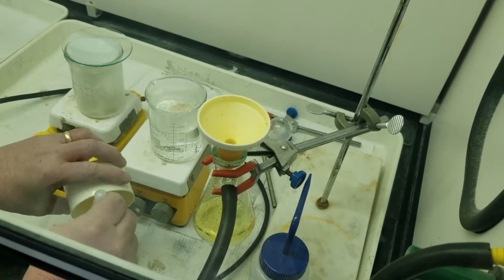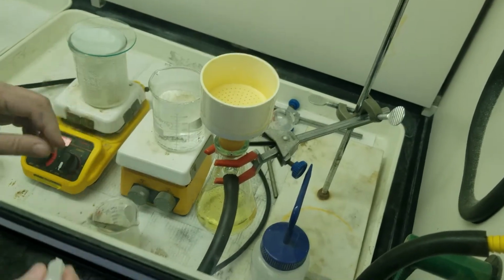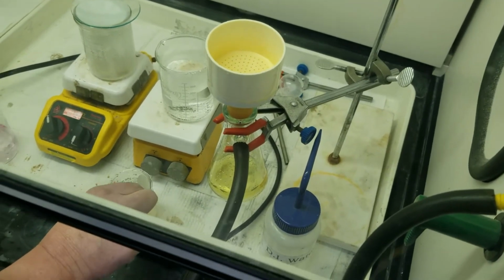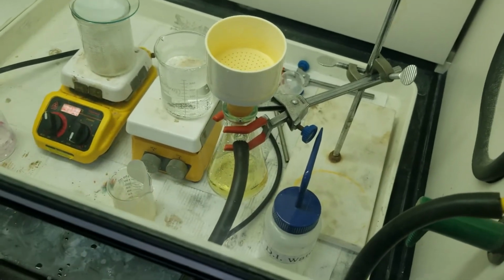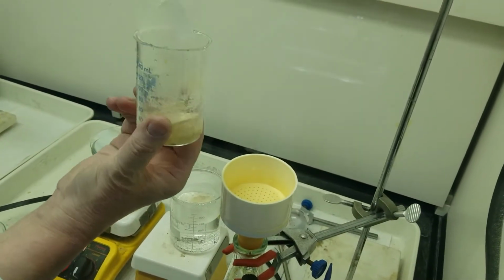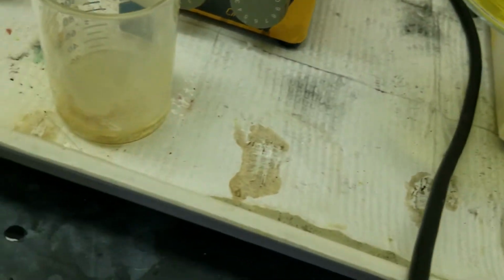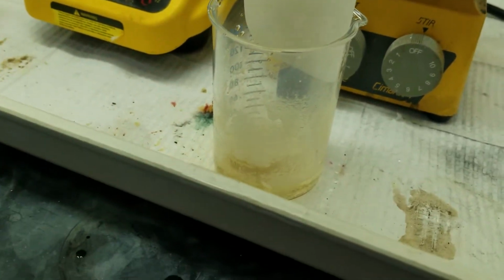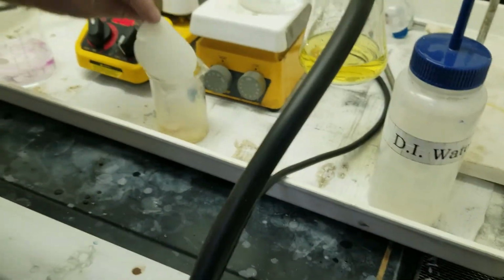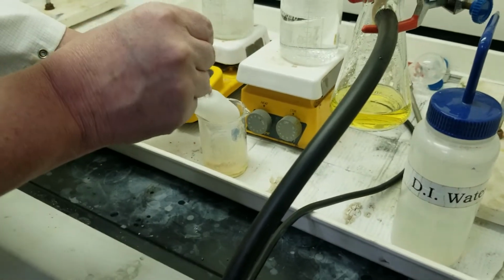Now this lab goes so well that sometimes we end up with over 100% yield for the simple reason that evaporating water off takes forever. So just like in 241, if we look at our crude product, you see the brownish color? We're going to have to do a decolorization. But before we do that, we have to bring everything to a boiling temperature, and we have to remove this piece of filter paper. Make sure none of our product is on the filter paper.